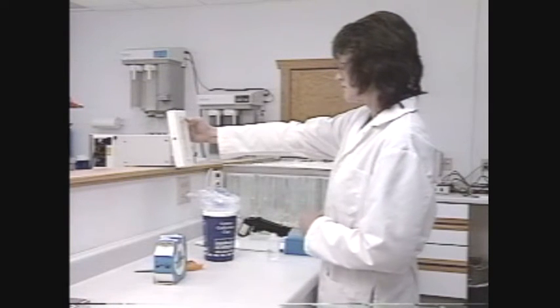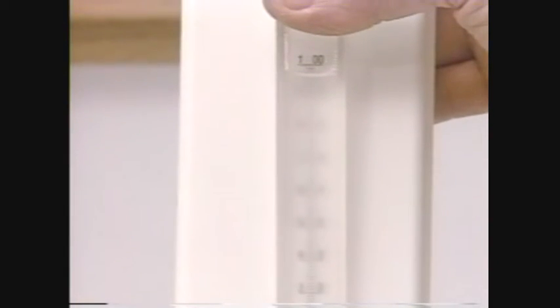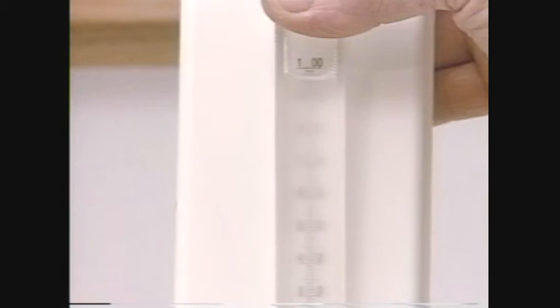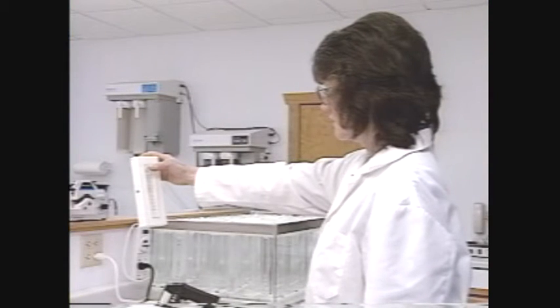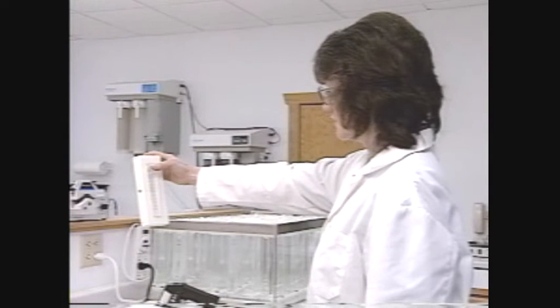To estimate the concentration, the densimeter is placed in front of a solid white surface or paper. Holding the unit at arm's length, at eye level, the scale is observed. First, the markings for the printed numbers, 60, 70, 80, and so forth, are identified. Look for the highest number that is clearly readable, such that the next highest number is cloudy. As shown here, the mark for 50 is clear, while that for 60 is cloudy and not readable.